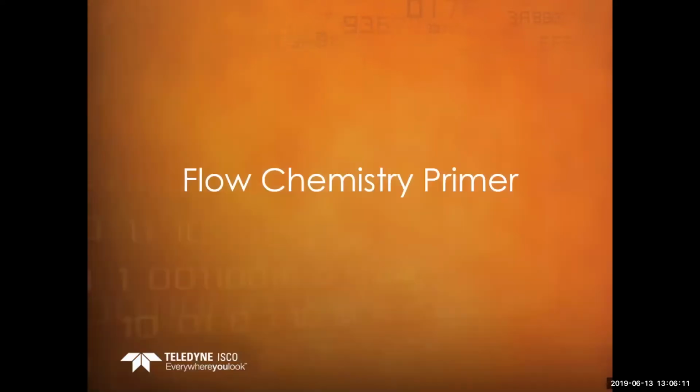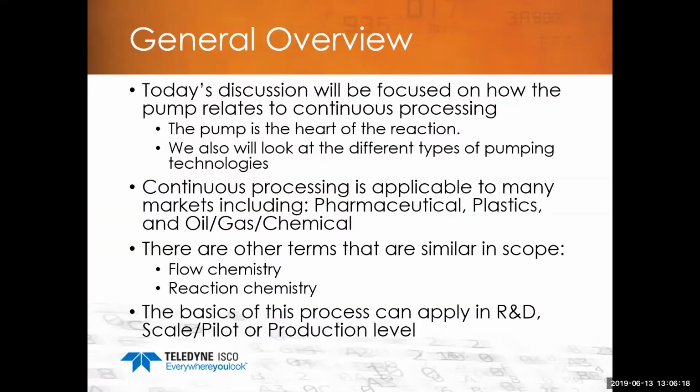As we step down a little bit, let's talk about flow chemistry in and of itself. Defining flow chemistry is an important piece here. We're going to focus the discussion on how the pump relates to continuous processing, which is another word for flow chemistry. In the research we've done, and customers and end user customers we've talked to, the pump is the heart of the reaction, and specifically the heart of the reaction chemistry. But we're going to look at a few different types of pumping technologies today.